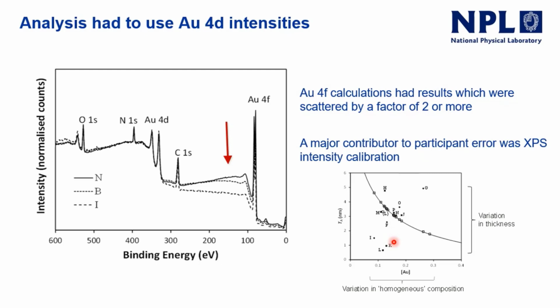Okay, so that's the transmission function that's uncorrected, and that gives you a factor of 50% at least in uncertainty in the results that you're getting out. So it is important. You do have to pay some attention to it.